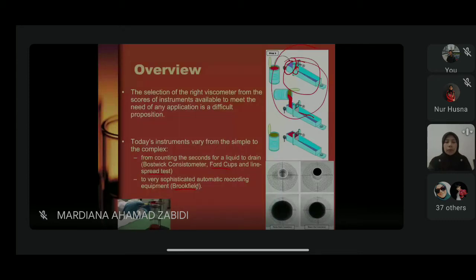And then of course, there are some other types of viscometer. This one is not Brookfield lah, other brands. Other brands are going to give you an immediate reading, whereby when you submerge the spindle into your sample, then you start to rotate. Once the reading is stable ataupun consistent, then you will take that particular reading. That reading is your viscosity, the viscosity of that particular product.